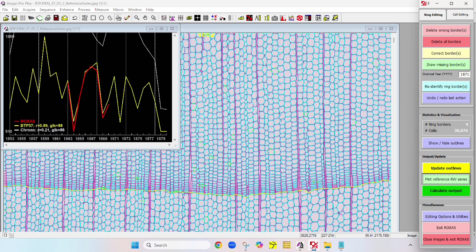I usually put it in the Excel sheet with all the years that I have for each image. I actually found last year that two samples were switched because I was looking at the R values and they were really bad for an entire preview image. So 5 different ROXAS images were wrong, and that's how I was able to pinpoint that they were swapped. So it's good to acknowledge the R value, maybe record it and keep track of the R values for each of these, but this line is more important. So it lines up. R value is 0.99, so that's great.